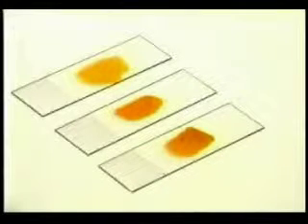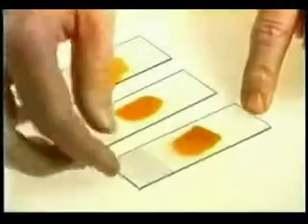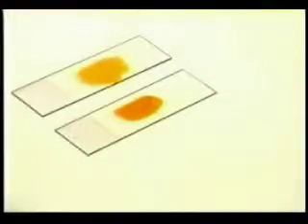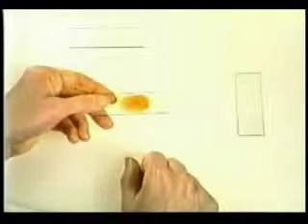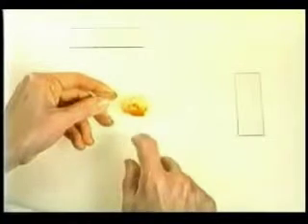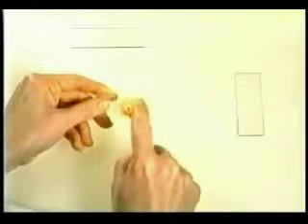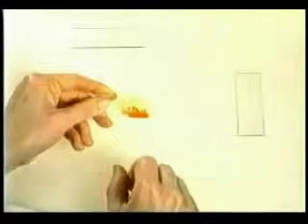If there are several slides, make a quick assessment and start working with a slide that shows multiple fragments. If no fragments are visible to the unaided eye, the harvest is probably non-diagnostic, and the repeat thin needle aspiration biopsy may yield better material. Now tilt the slide sideways. This will make the fluid collect along the bottom edge and leave the fragments exposed over the rest of the slide.